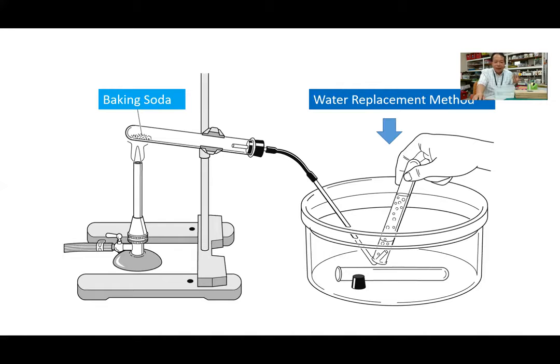Okay. Generally speaking, in rural areas, it is very difficult to get this quality apparatus. But we don't have to give up. We can use very low cost and very daily materials. Okay, let me show you.